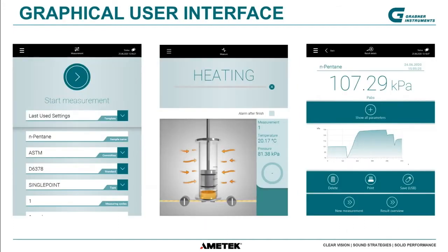So, a little bit about the theory. I have also put some of the graphical user interface in all the slides. As I said, you just need to press the start button after having selected maybe a template. And then you see a graphic representation of what's going to happen. And finally, you get the result of your measurement, and also a nice graphical representation.